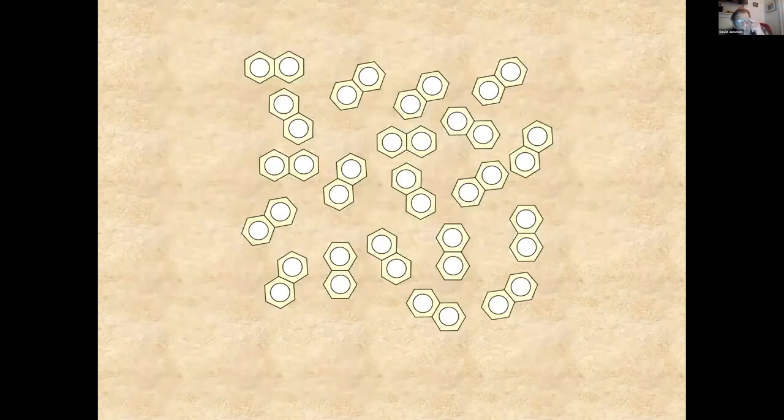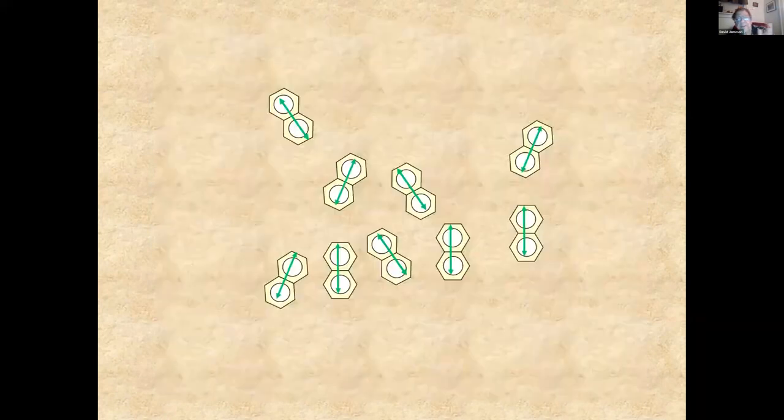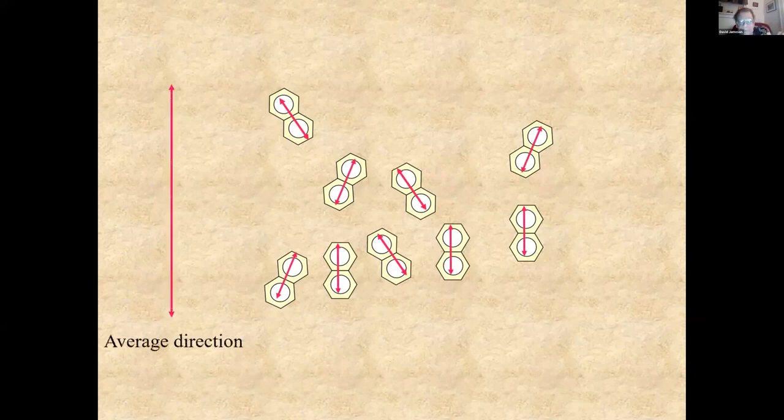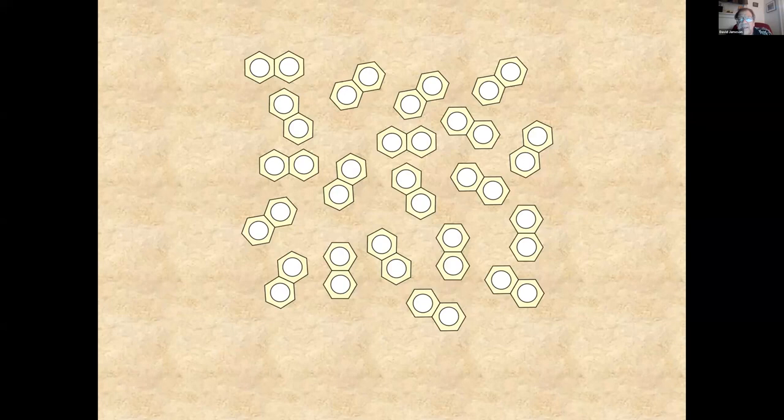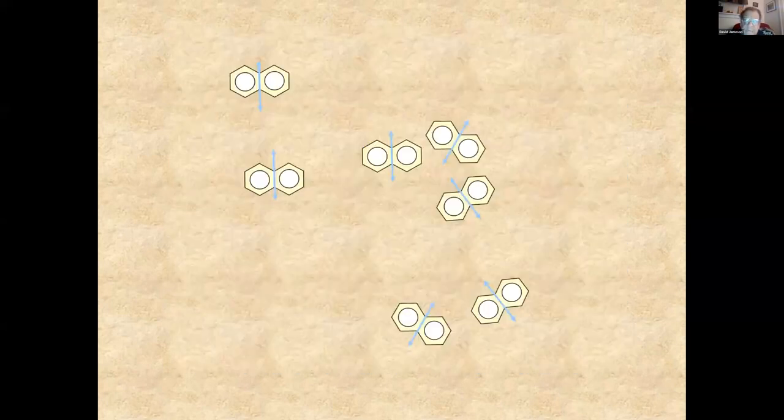And so let's see what happens. So let's consider a molecule like this, and let's suppose we excite with the S0 to S1, and we select out of the population these molecules. And these are the ones that emit. And the emission dipole is parallel. So the polarization we're going to see is going to be relatively high. Now consider we excite with a different wavelength of light, and we're photoselecting a different population.